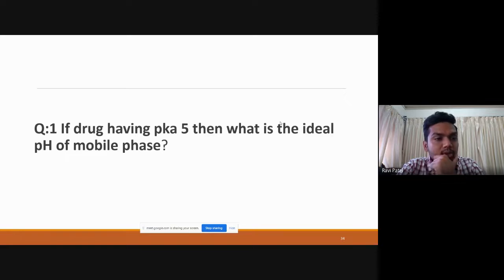The another question is, if my drug has a pKa of 5, then what is the ideal pH of the mobile phase? As I told you, never use a mobile phase pH that is similar to your pKa. It should be at least 2 units different, right?